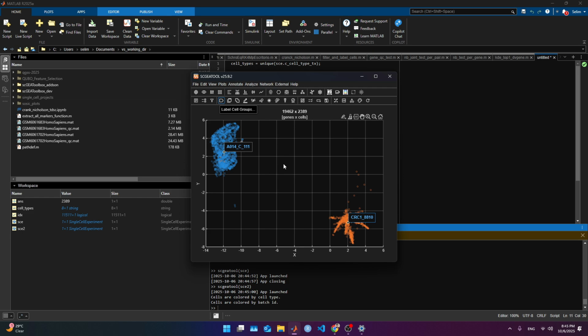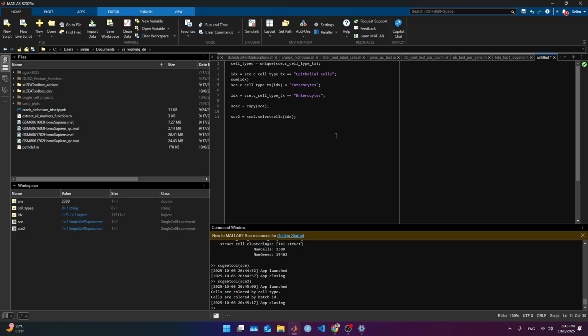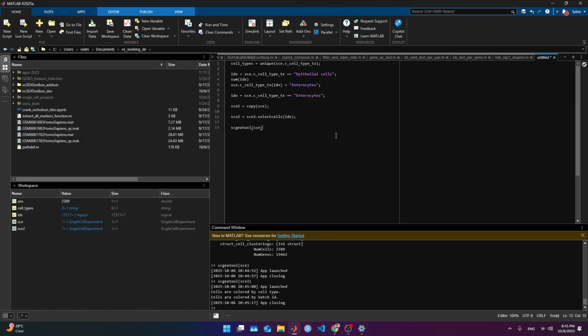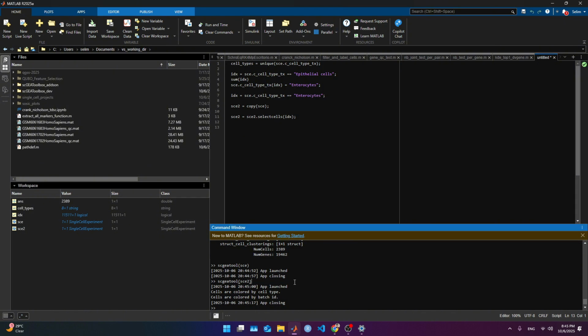What we can do is differential expression here, but we are going to do it by hand today, so we know and appreciate all this process. So the Wilcoxon, well, first of all, we need to take out the gene expression we want to look at. scGEAToolbox SCE2. I'm going to try to, my bad. Let me copy that.